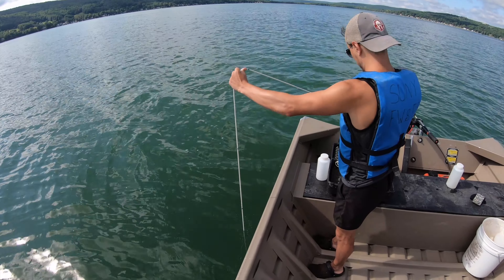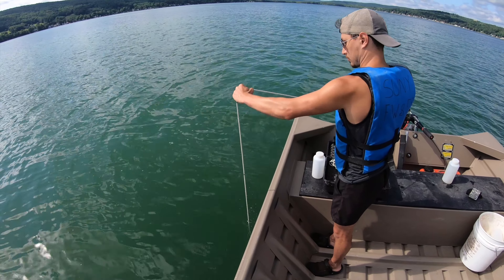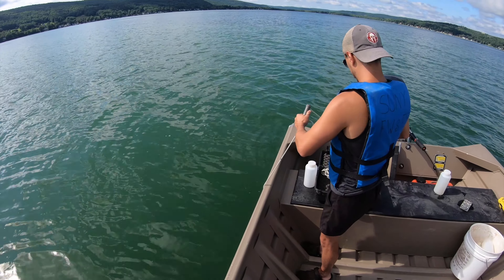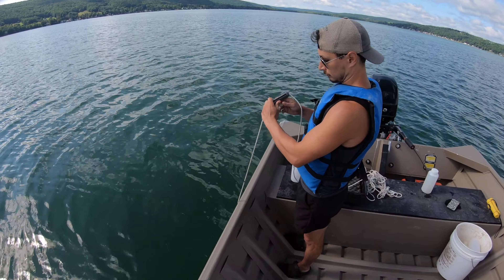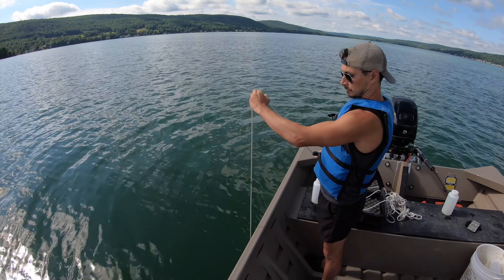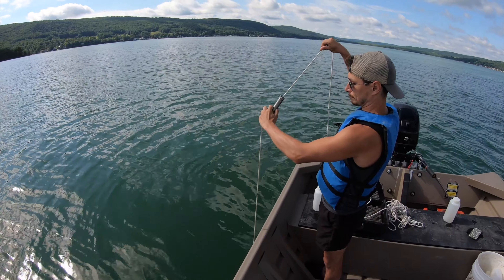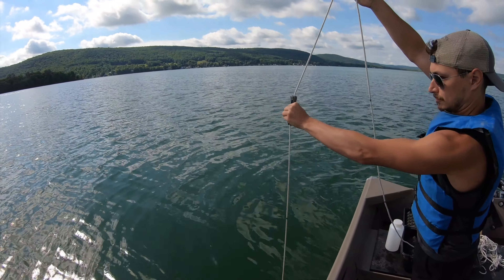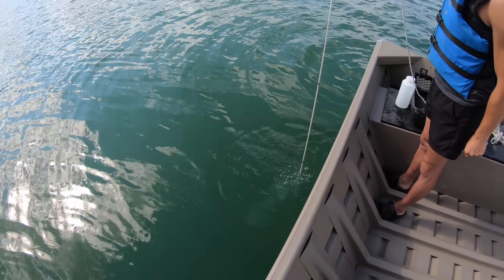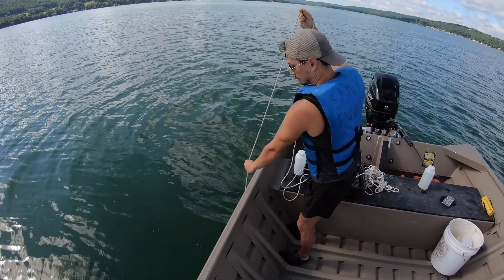When you hit the bottom with a Kemmerer bottle, a bunch of sediment gets stirred up that can really throw off your water quality readings. Matt has got this all the way down to the bottom now — we're about 39 feet. Cana-Dorago has a max depth of about 40 feet, so we're right about there. He'll take the messenger and send it perfectly down the rope to close the bottle, then pull it up. He can feel when it closes.